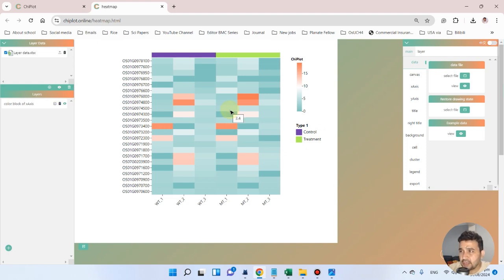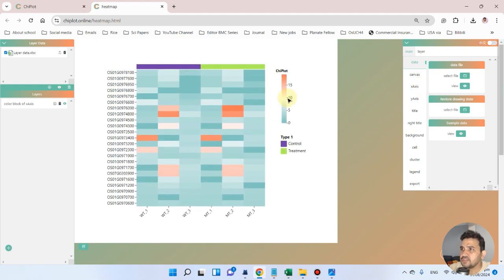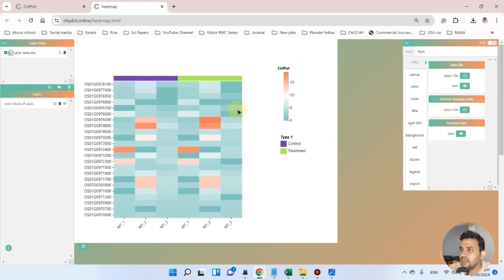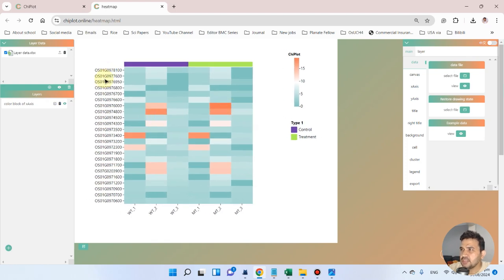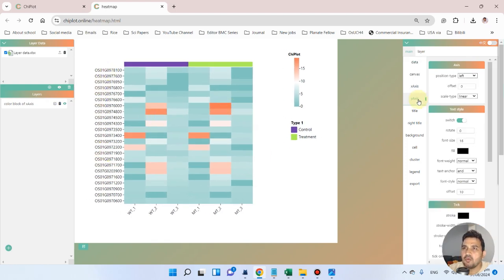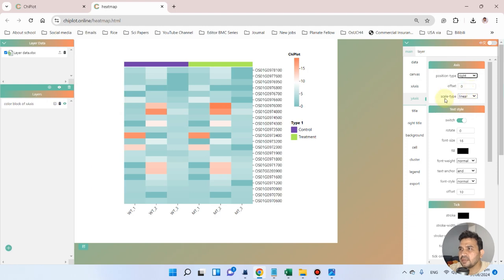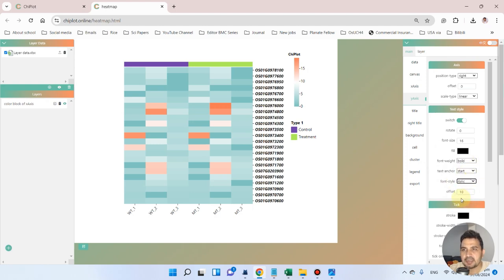Now let's change a few options to make it more beautiful. Double-click to change its position so we can move the gene names. On the y-axis, we can move labels from the left to the right. Gene names are mostly italicized, so we can make them bold and italic. For the x-axis sample names, we can also make the font weight bold.